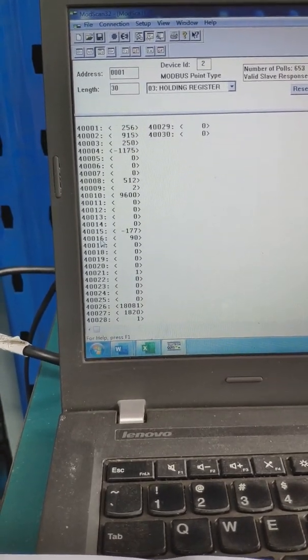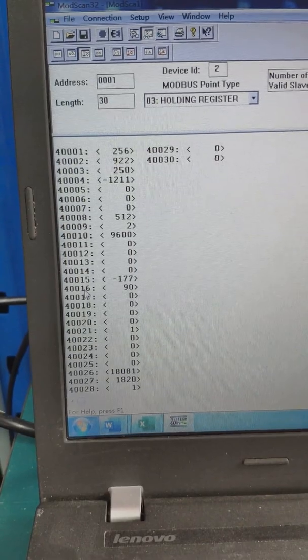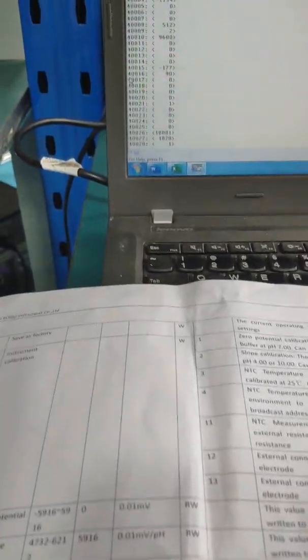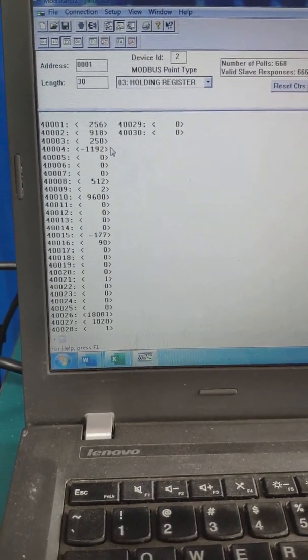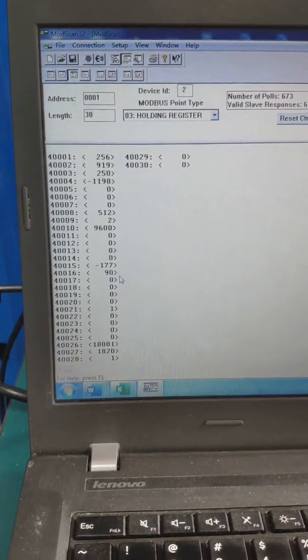You can see the calibration slope. The MotorScan address for the slope is register 16, and register 15 is for the electrode slope value. The value is above 90, which means the electrode is okay.